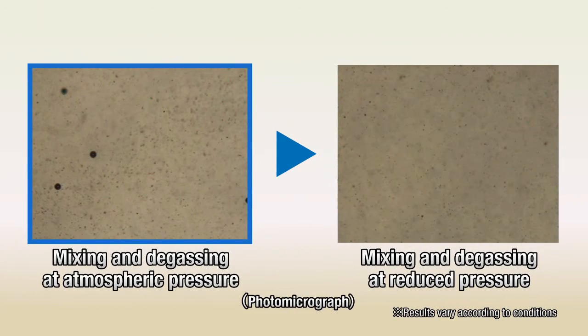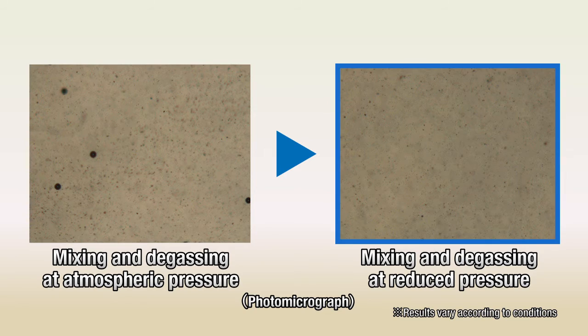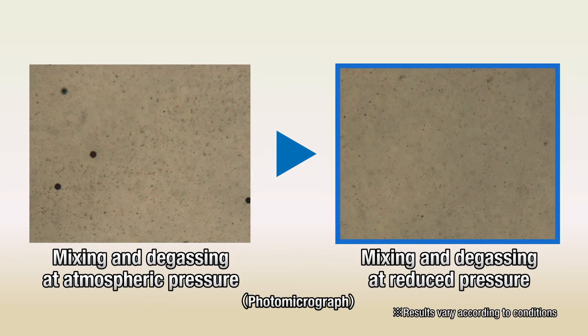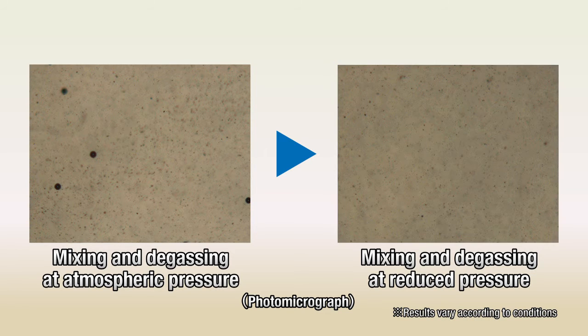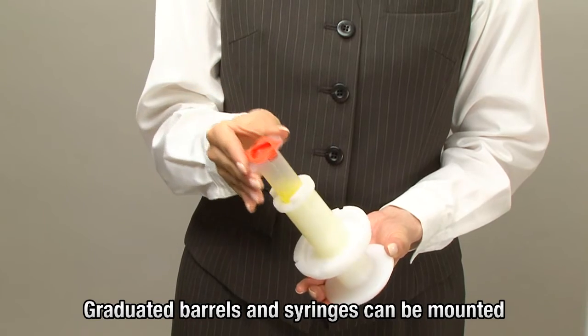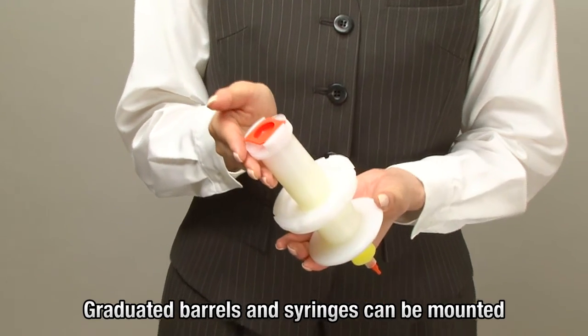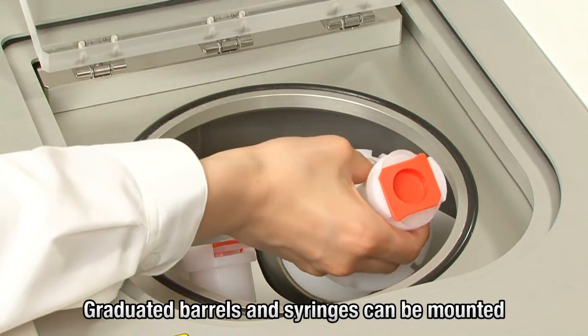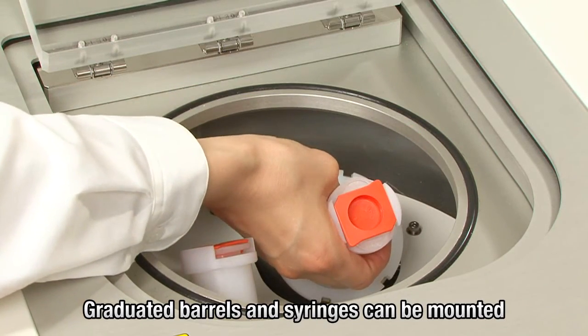In the photo on the left, trapped air has been broken down into an infinite number of microscopic bubbles through vacuum decompression. Even the microscopic bubbles are removed, as shown by the photo on the right. Moreover, long barrels and syringes can be set in the holder and positioned at a fixed distance from the revolution axis for even mixing.